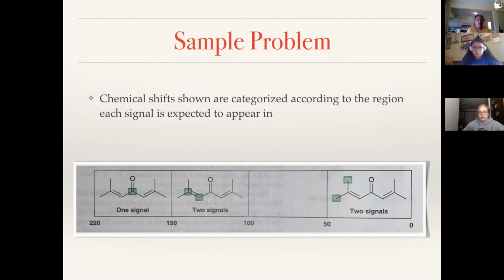So you're looking at the unique carbons, and if you have 5 unique carbons, you need to have 5 signals. So you should be able to draw the spectrum, okay? Give the axes like how you did for even the NMR to be able to draw the signals in the ranges. And these are all shown as signals.